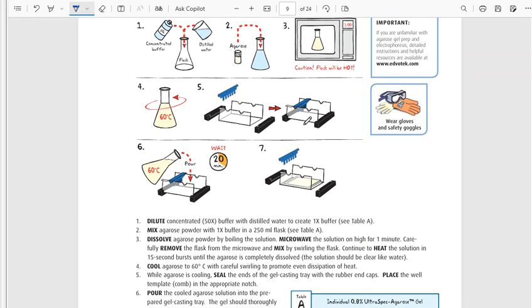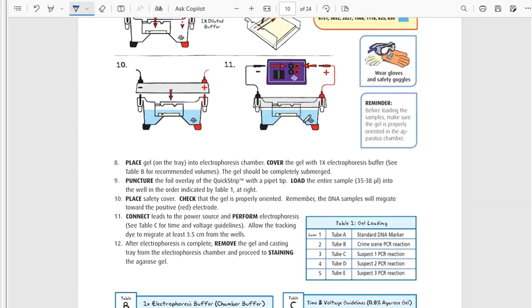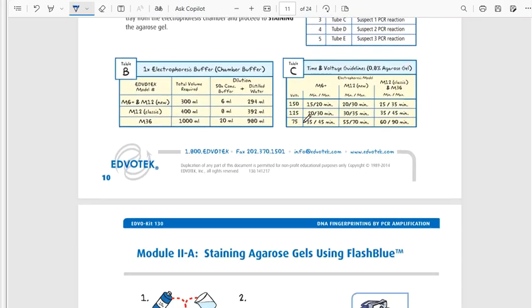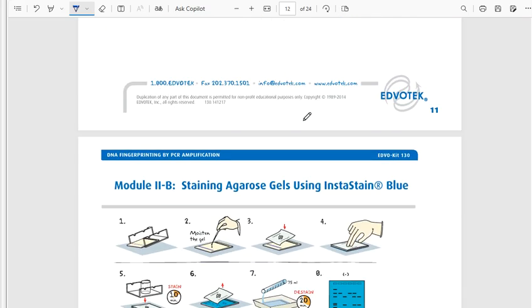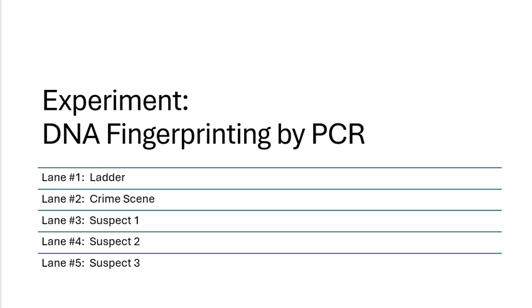We went through the electrophoresis. We went through the recipes. We hooked them up to the voltage chambers. We analyzed them, we stained them, and then we destained them. And we ended up with a gel, and that gel needed to be stained because we could not see the base pairs, and that's normally kind of what goes on.